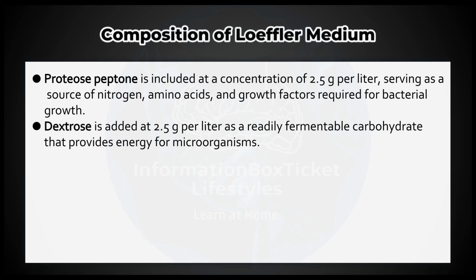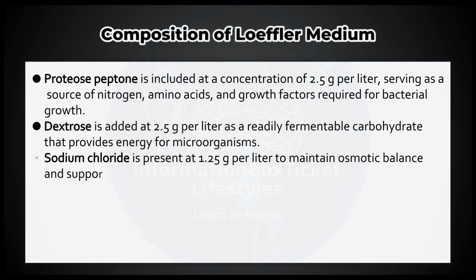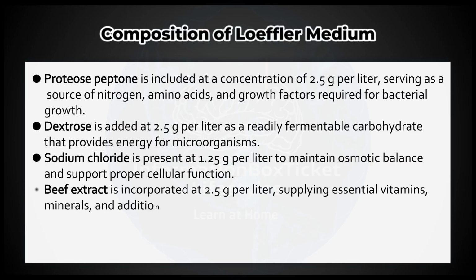Dextrose is added at 2.5 grams per liter as a readily fermentable carbohydrate that provides energy for microorganisms. Sodium chloride is present at 1.25 grams per liter to maintain osmotic balance and support proper cellular function. Beef extract is incorporated at 2.5 grams per liter, supplying essential vitamins, minerals, and additional growth-promoting substances.